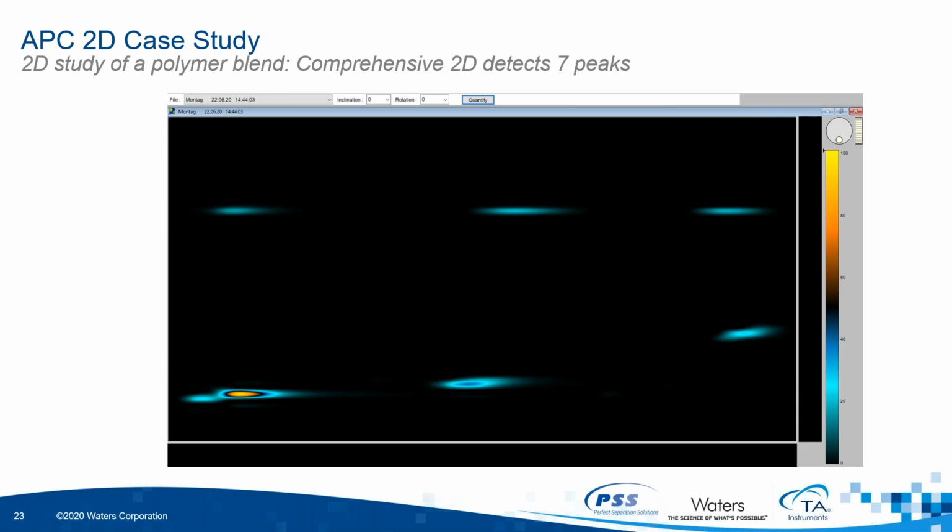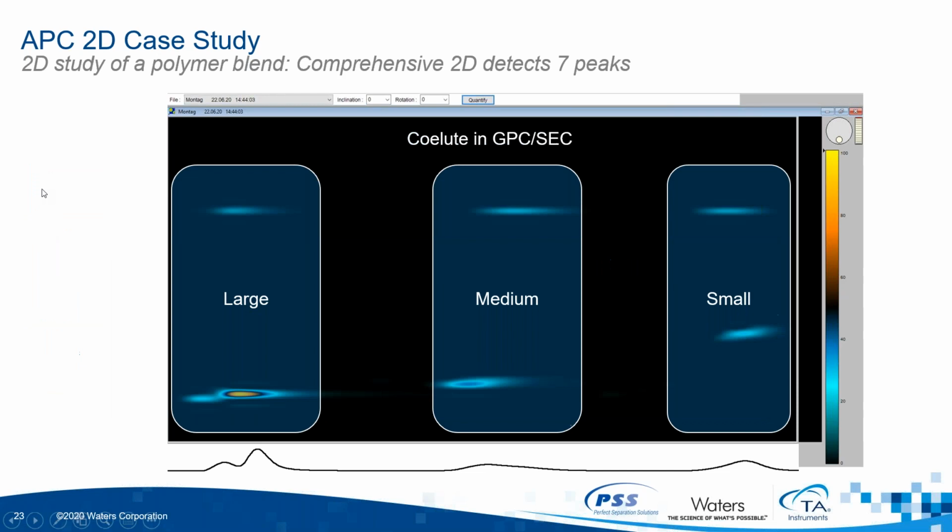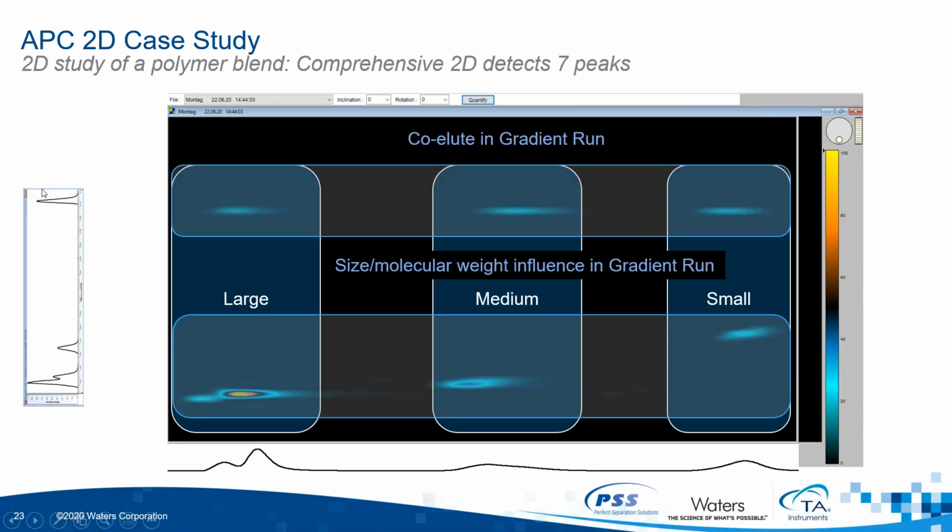Next to the y-axis, you can see the individual gradient result, and on the x-axis, the individual detector trace from the SEC separation as references. The boxes around the multiple populations denote fractions that eluted simultaneously. The vertical boxes indicate where separation by size has occurred.